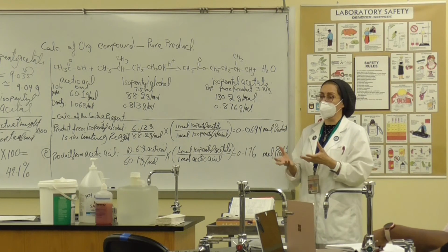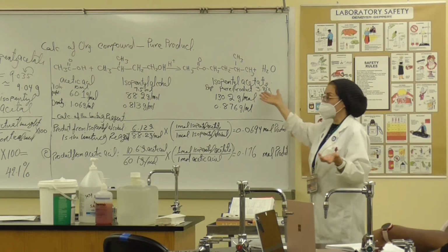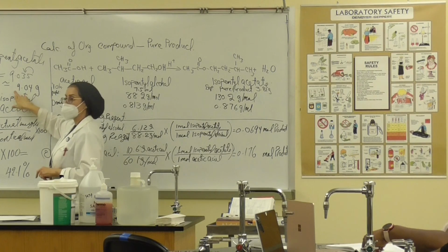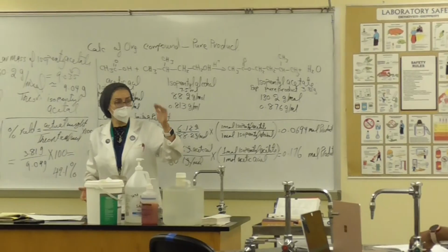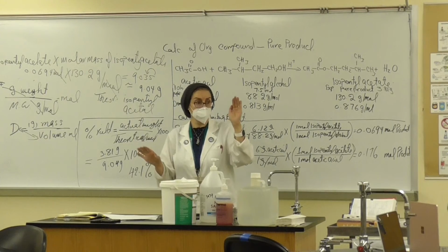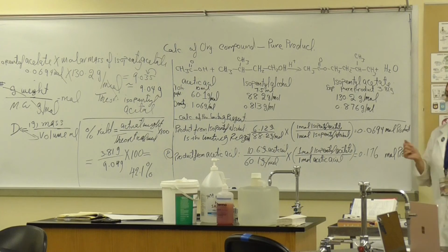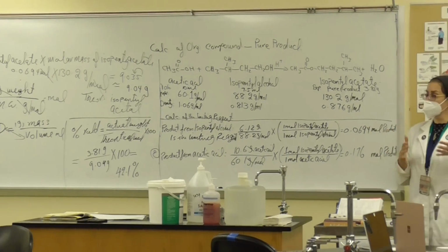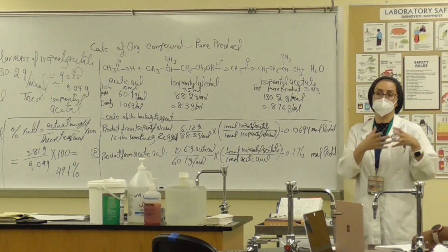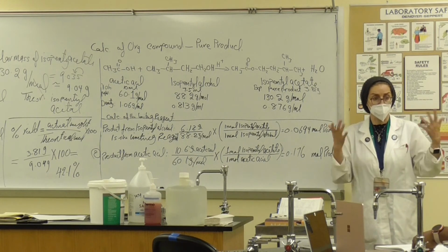So it is very important that we keep those compounds. After you have the crude compound, then you go through purification, and the last one, therefore, if you look at this versus that one, this is the theory. This is what we expect in the best conditions. We would expect to collect at least 9 grams. But in reality, they collected only 3.8. So within the steps of purification, extraction, recrystallization, we lost some of this compound. These are the steps that you are going to go through.